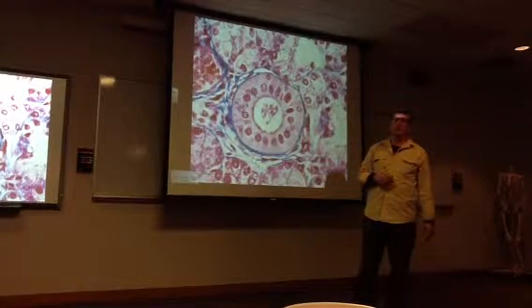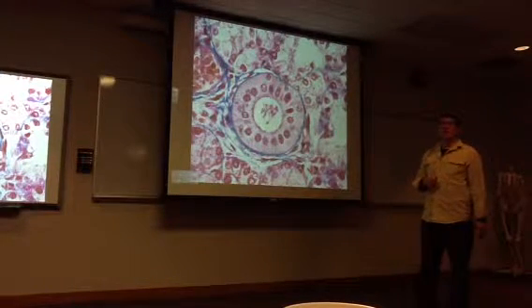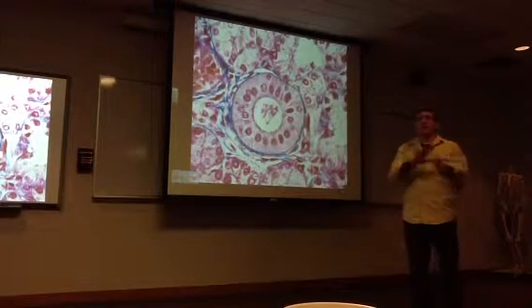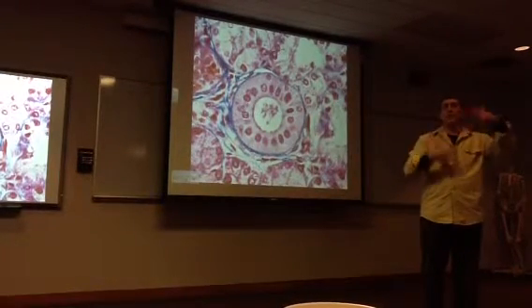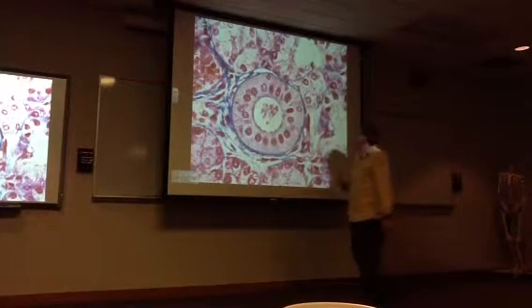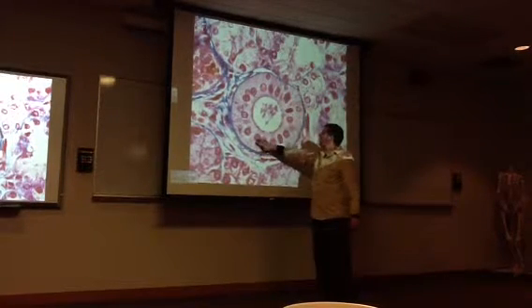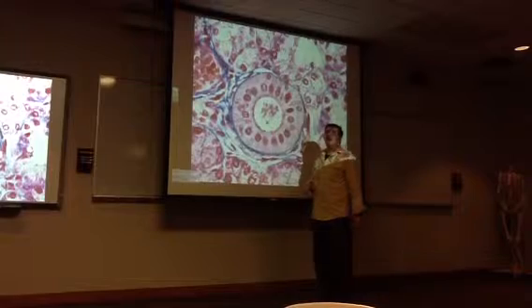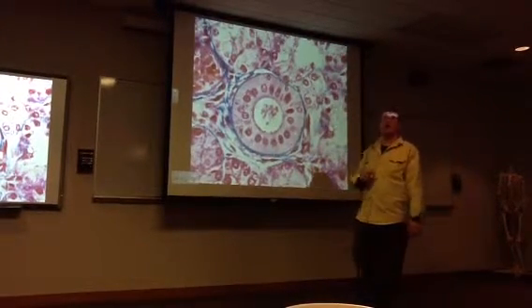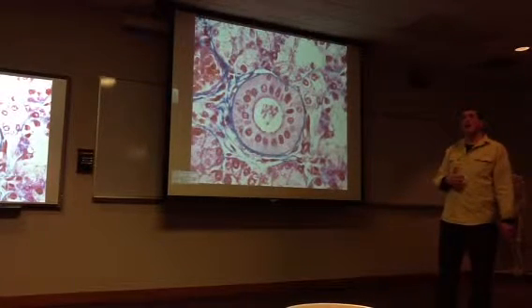Is it fair to look at the nuclei as a... It is. Okay. It is fair to look at the nuclei, okay? Now, I think on the exam that we give on Tuesday, everyone will probably agree what the tissue is, okay? But on a glass slide exam, I may have one where all the nuclei look like this, and yours may have one where they look like that, okay? And I'd call it simple columnar, and you would call it simple cuboidal, and I'd mark you wrong until you come and ask me to look at your slide. And then I'd come back and give you credit, okay?